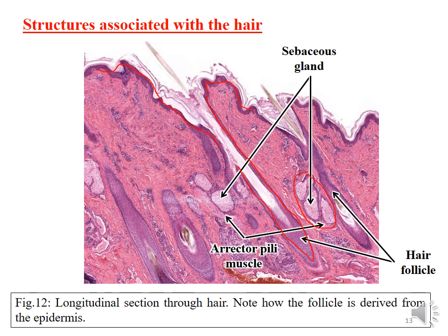This is a sebaceous gland, and this is a sebaceous gland. And we have the erector pili muscle. For example, in this part here, this is the erector pili muscle. As you can see, we can barely see it in this part and this part. These are hairs. This part of the hair is found outside the skin. So this is the shaft.